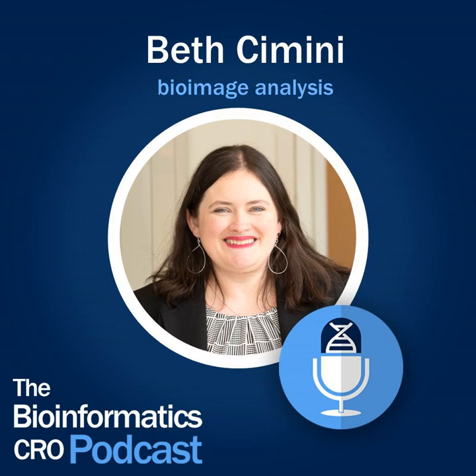For listeners who are new to bioimage analysis, what's the core problem you spend your time trying to solve? Yeah, so mostly we deal with images that come from light microscopes, and it feels like light microscopy should be a solved problem because we invented it in the 1600s, right? But it turns out that we invented light microscopes about 300 years before we invented computers. And so there's a fantastic diversity of biology that we can study under the microscope. And cells might be anywhere from a pixel to a whole field of view. There's tons of different fluorescent antibodies and can have many channels.